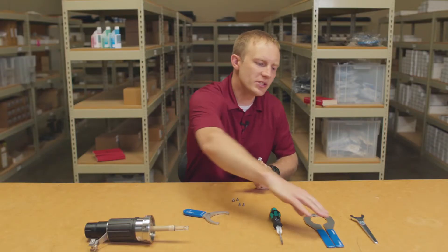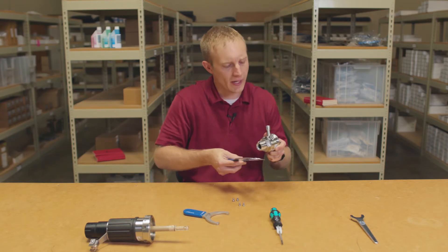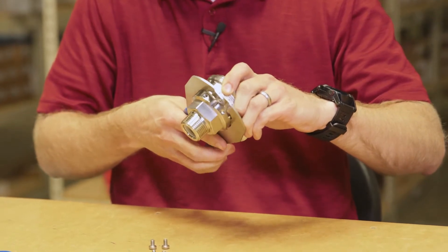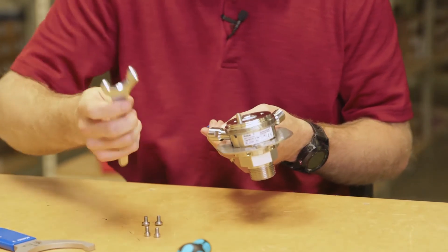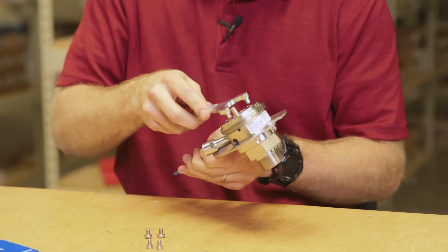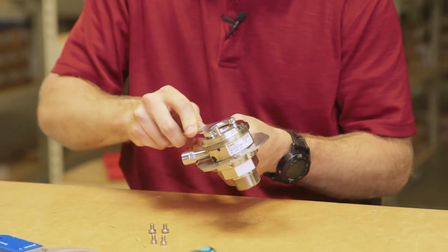Next, position the pliers in the two grooves located underneath the screw connections, and remove the cleaning and calibration chamber from the process connection using spanning wrench number five from our service tool set.